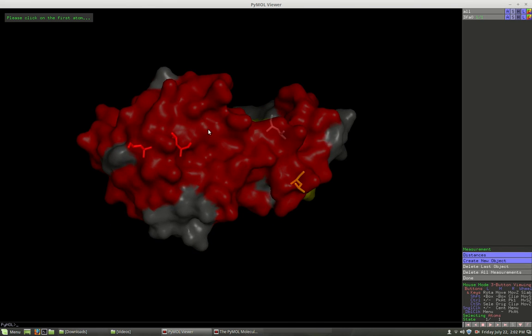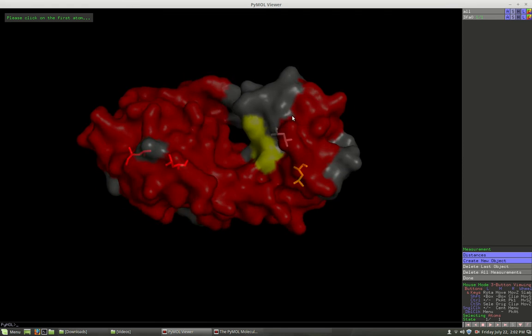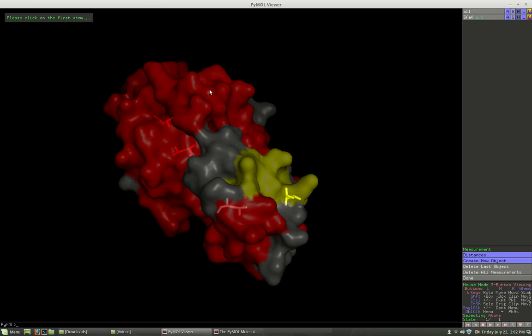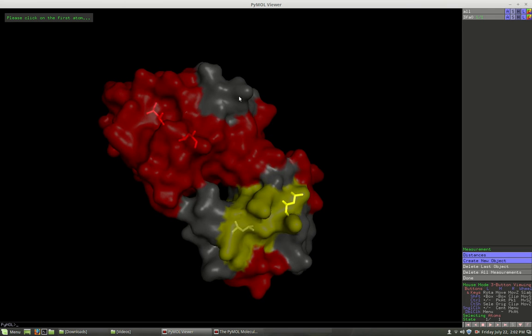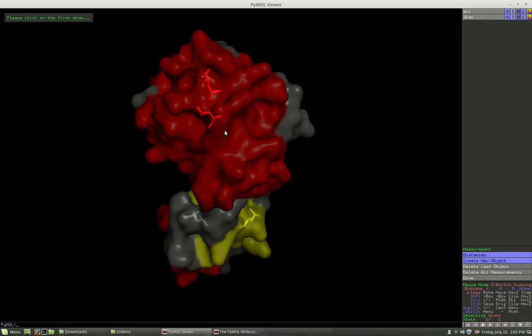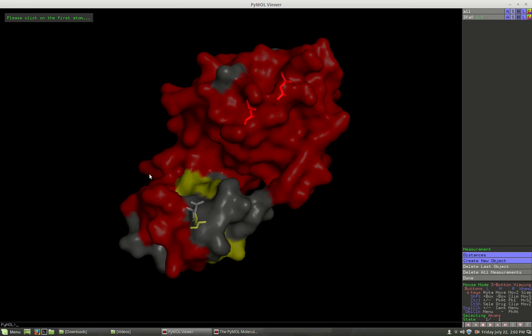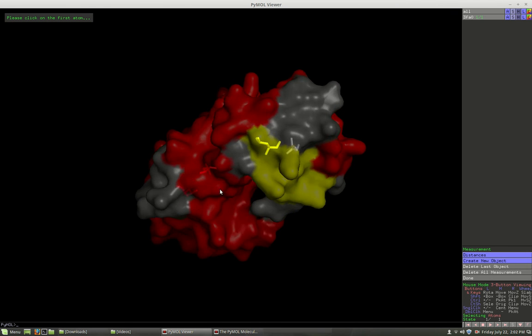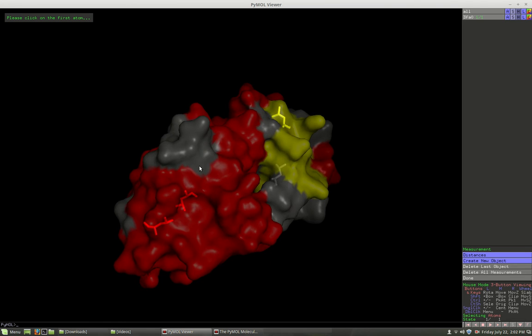relation to it. Are they on the inside or the outside at any given time? When we rotate this around, where are they in our inside here and what they're doing? Could be useful if you're interested in knowing about what's going on inside the molecule as you rotate it, and from what direction you want to see how these are orienting themselves, these side chains for these residues. All right, now another thing you might want to do is show spheres.